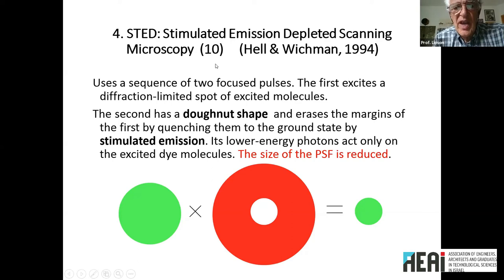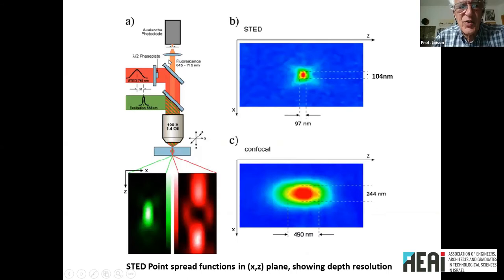So how does this work? Well, I'll show you the apparatus. Let's have a look at the next slide and then go back to this one. Here's your microscope.